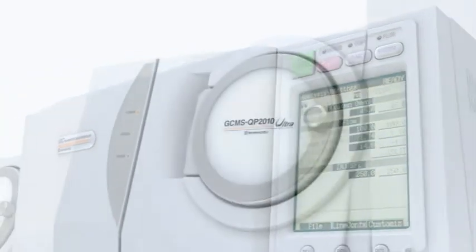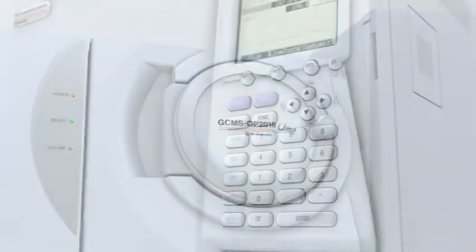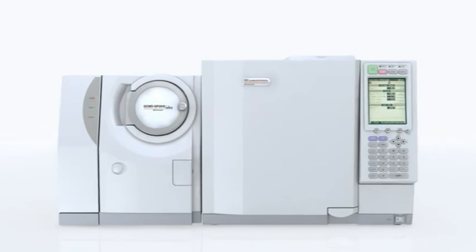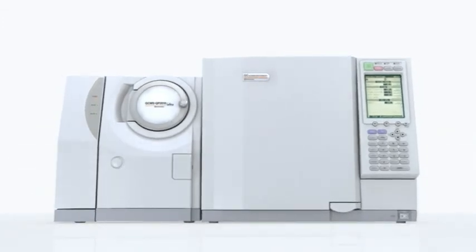With the new GC-MS QP2010 Ultra, Shimadzu offers a new solution for increased productivity, reduced running costs, and less environmental impact.